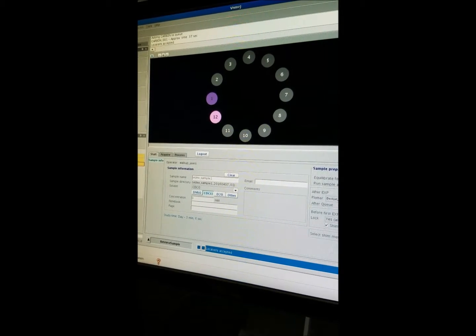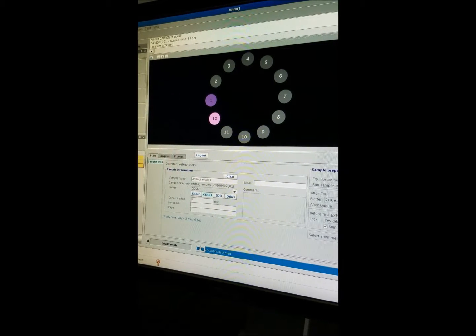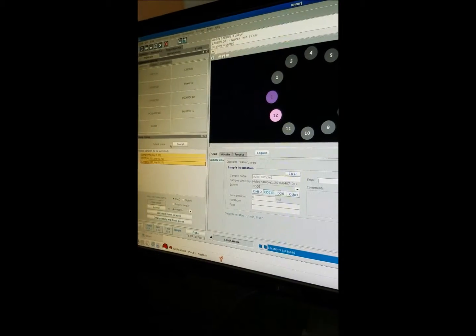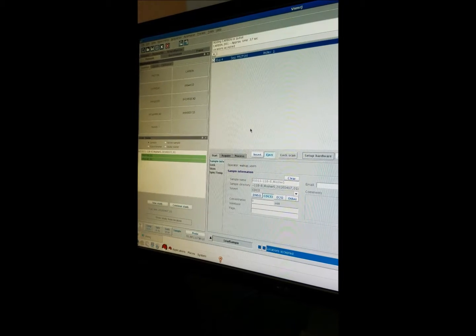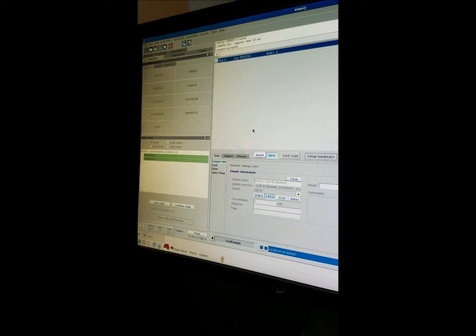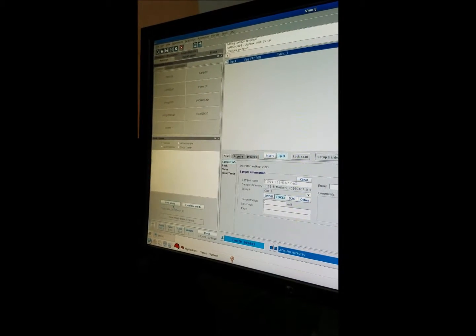So if I want to run another experiment outside of the experiment in sample holder 1, then the next thing I do is come to this submit queue. I click cancel, and when you click cancel, it won't cancel your actual experiment. It's just canceling you actually making changes to the first experiment. So now the next thing that I do is I'll come over and I'll click new study.